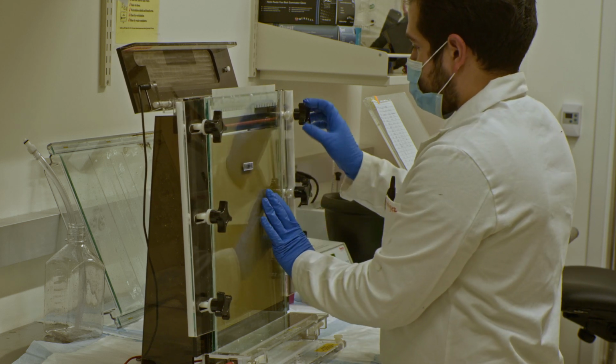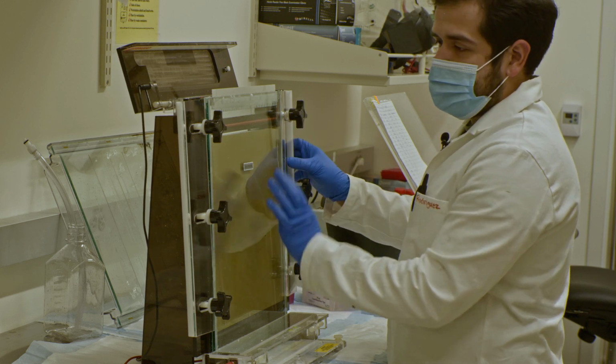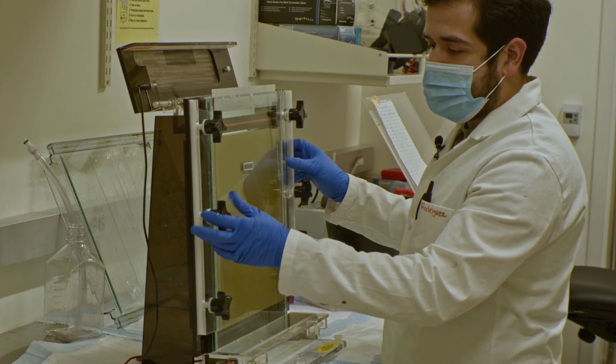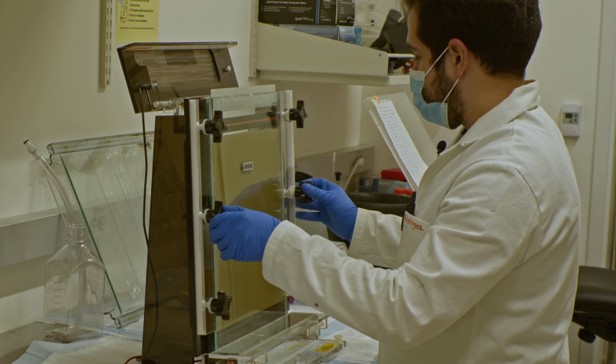So these flaps on the side of the gel hold it in. All you have to do is screw them in, and do so to keep them nice and even. Try not to apply too much pressure to one side at a time. Try not to apply more pressure on one side versus the other.